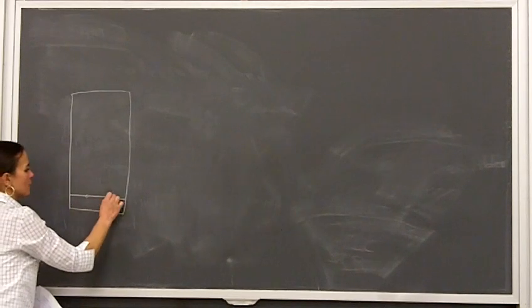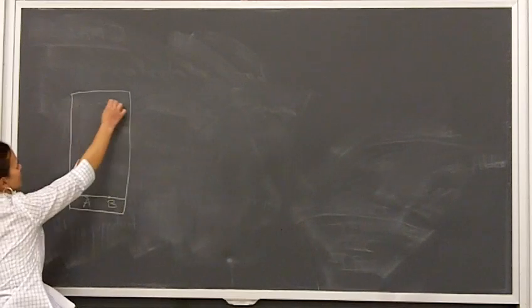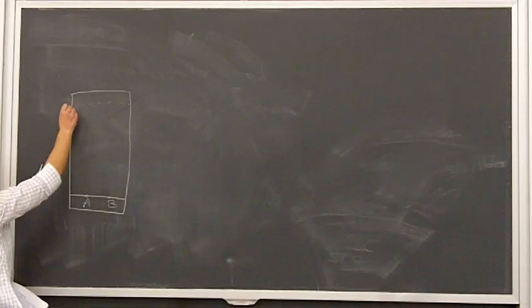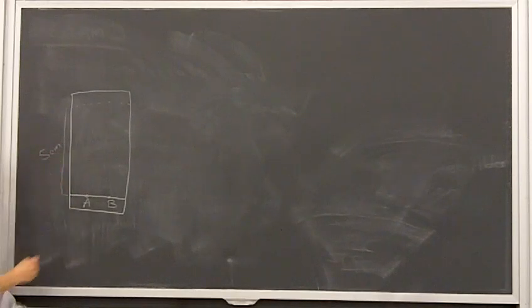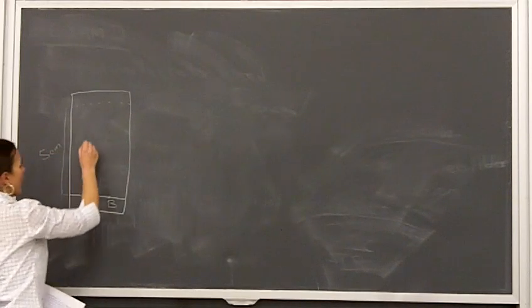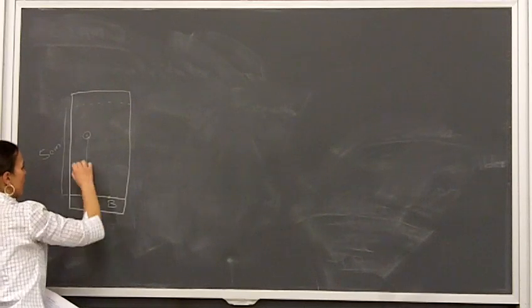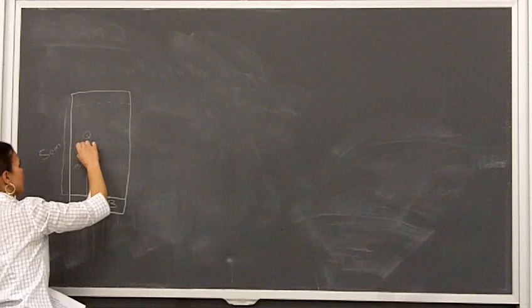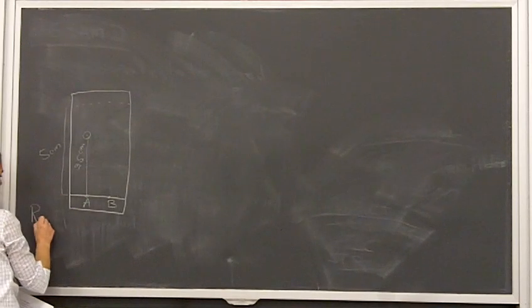Okay, let's say we have 2 points here, A and B, and we have our origin line here. Let's say the solvent front is 5 centimeters from the origin, and A has traveled 3.5 centimeters. So what would be the RF value for A?